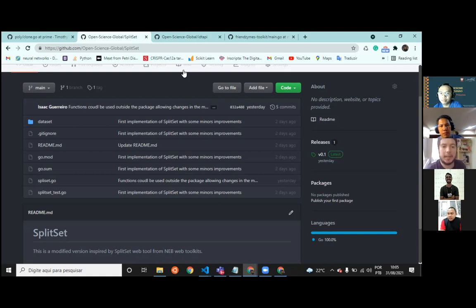You could actually use this if you have a set of primers that you use a lot of times. You could use the plasmid strategy to have an infinite resource of this plasmid, right? So you only have to input the plasmid inside the organism, and you have a lot of plasmids, and you filter these plasmids and you have a new set of primers, right? So this could be useful, maybe, but I think we could discuss more about how to use this.